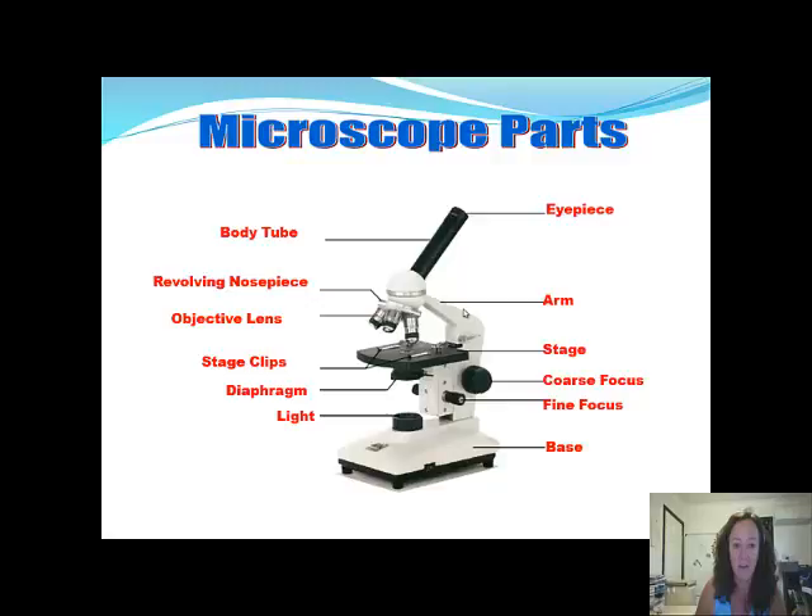This is called the stage, where you put the specimen you're going to be looking at. This is the coarse focus, which makes big adjustments. This is the fine focus, which makes fine adjustments to what you view. This is the base — when you carry it, put a hand on the arm and one underneath the base. This is the light being projected up through the specimen. This is called the diaphragm — make sure it's open, as it controls the amount of light let through. Sometimes students say they can't see anything, and you just adjust the diaphragm and you get a great view. These are called the stage clips, which anchor the microscope slide so it doesn't move.